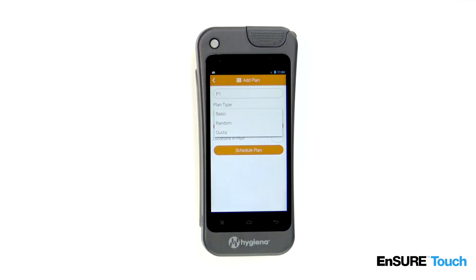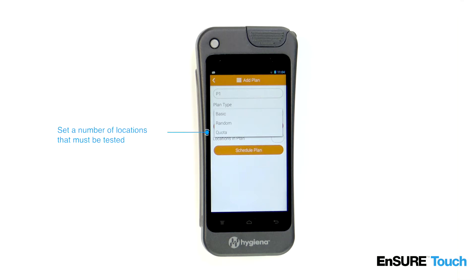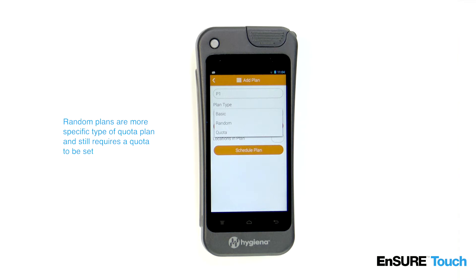Choose the plan type. Basic plans allow you to choose which locations you'd like to test. Quota plans allow you to set a number of locations that must be tested before the plan is complete. Random plans are a more specific type of quota plan and still require a quota to be set.